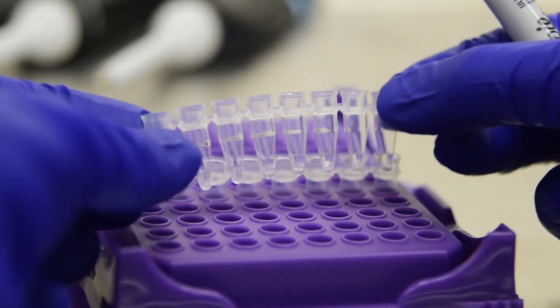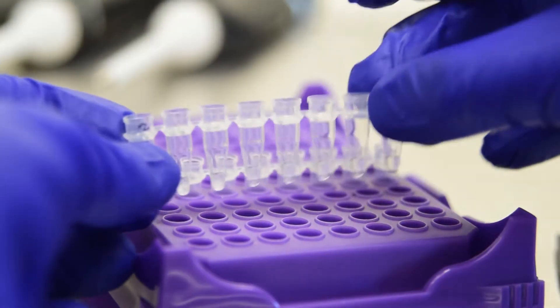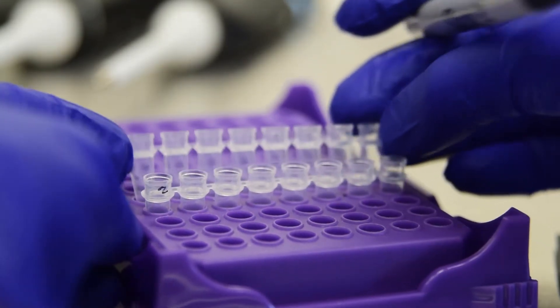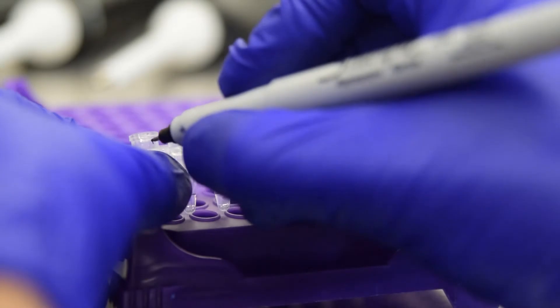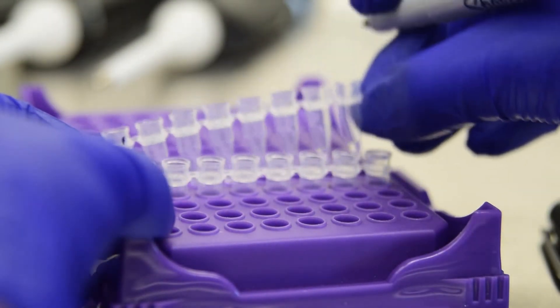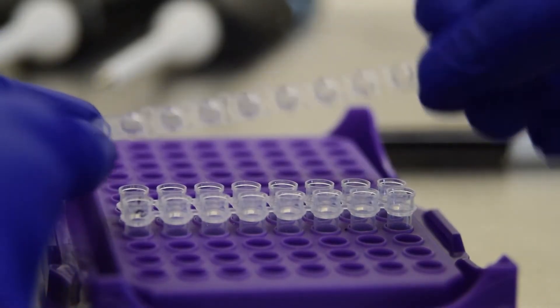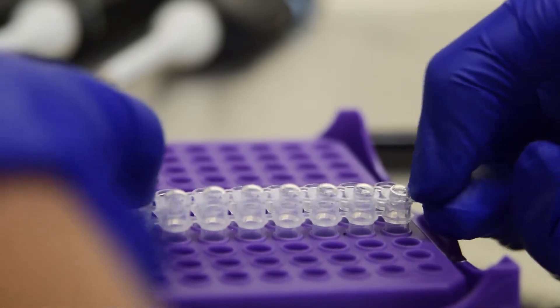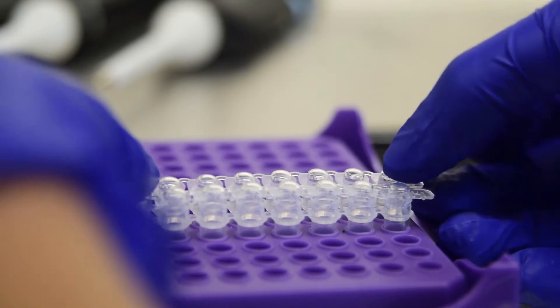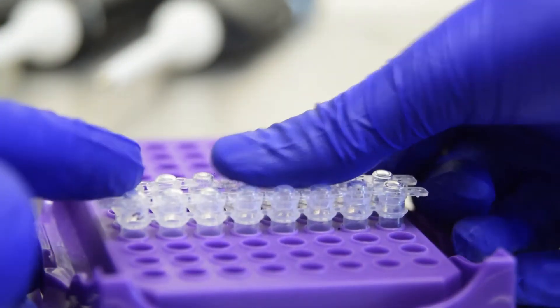Label your strips, place the caps on top, and label those too.